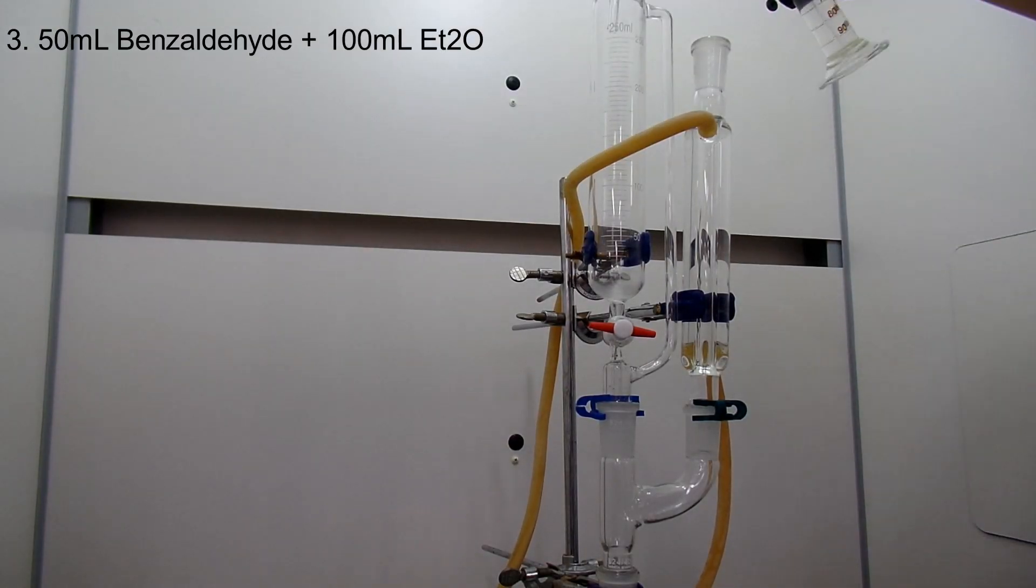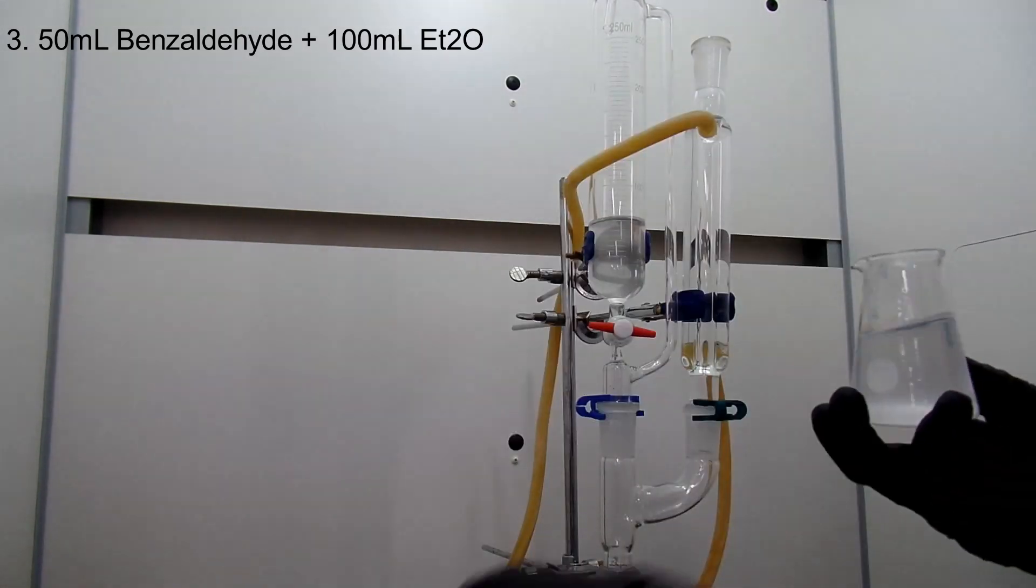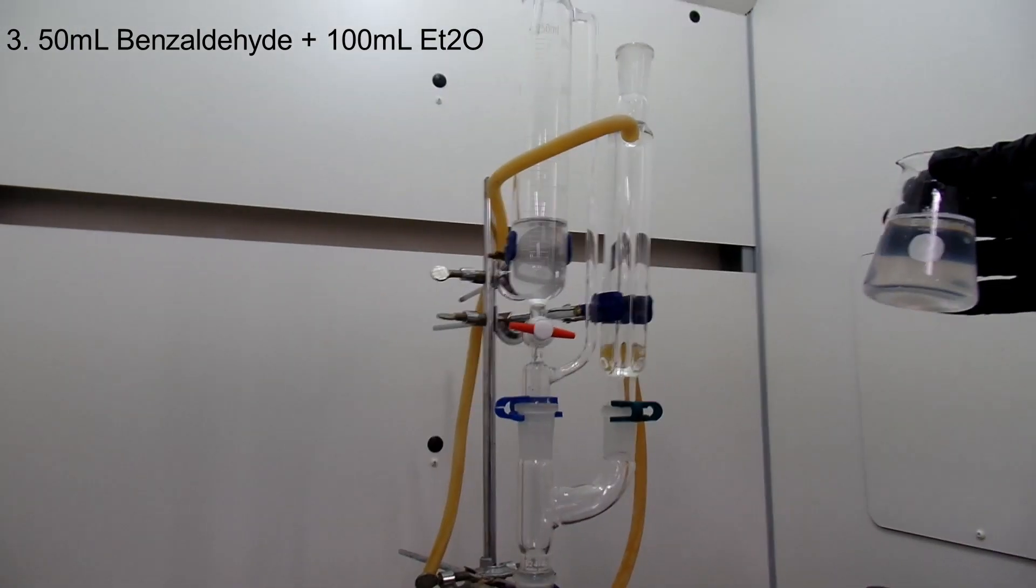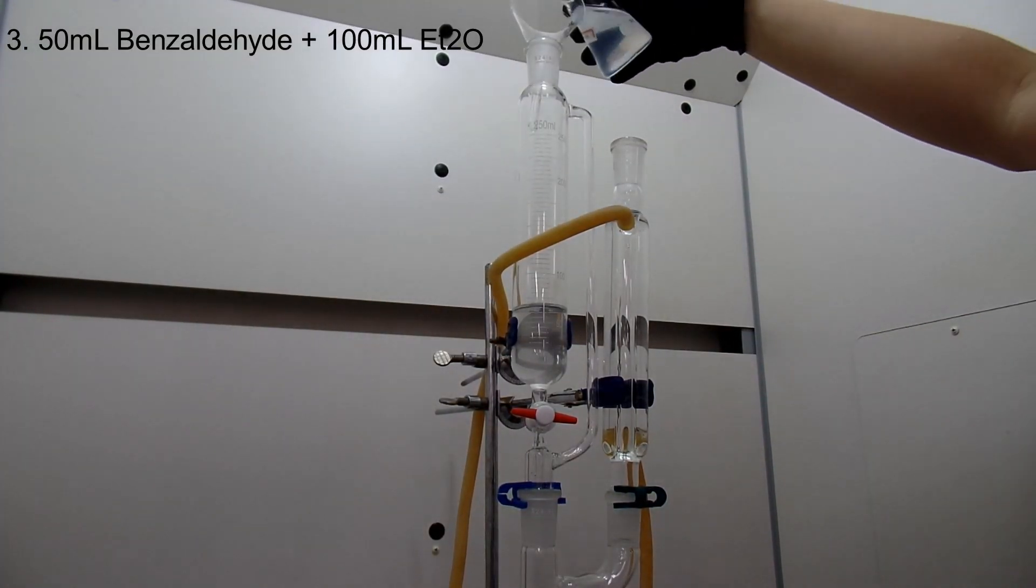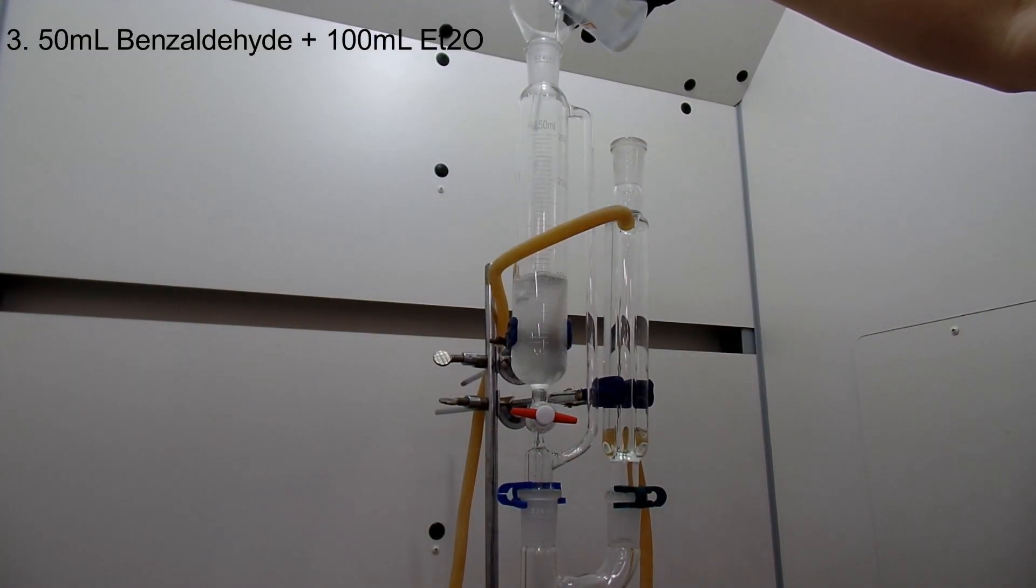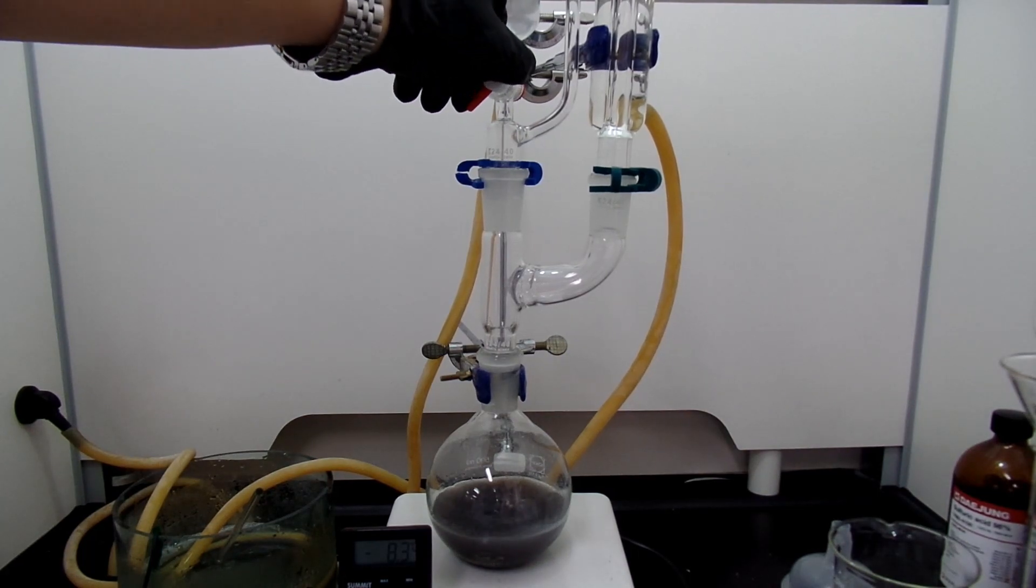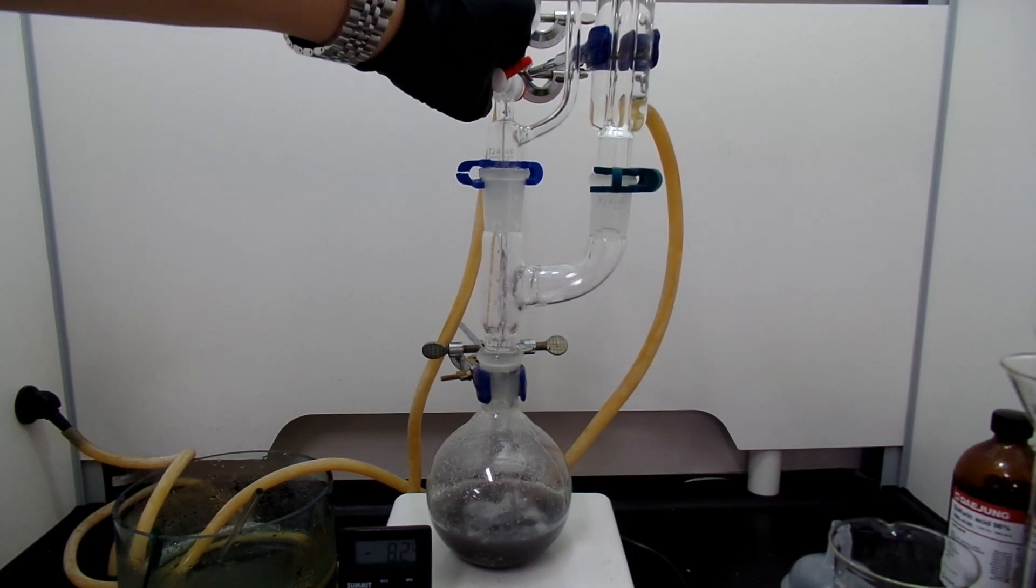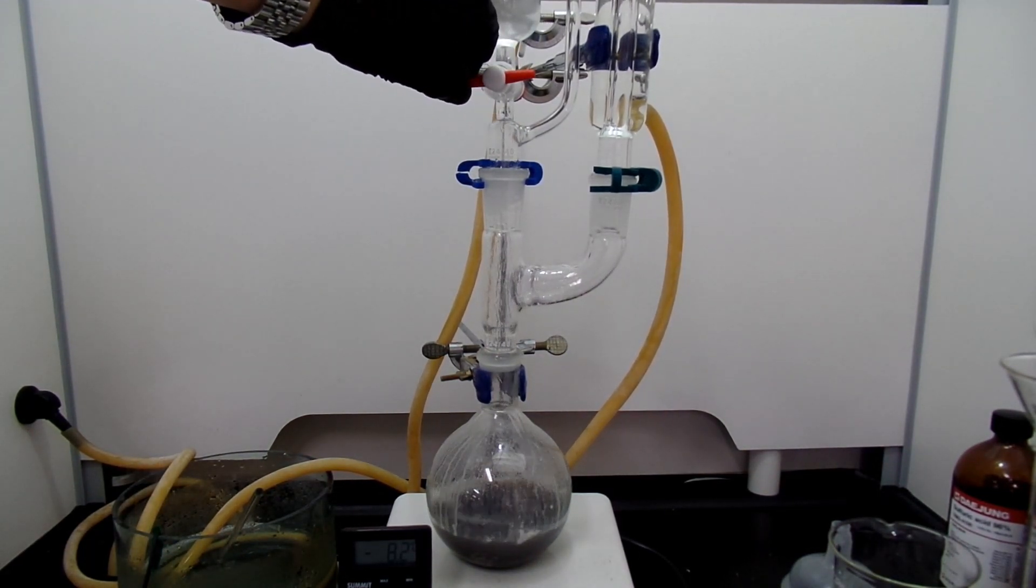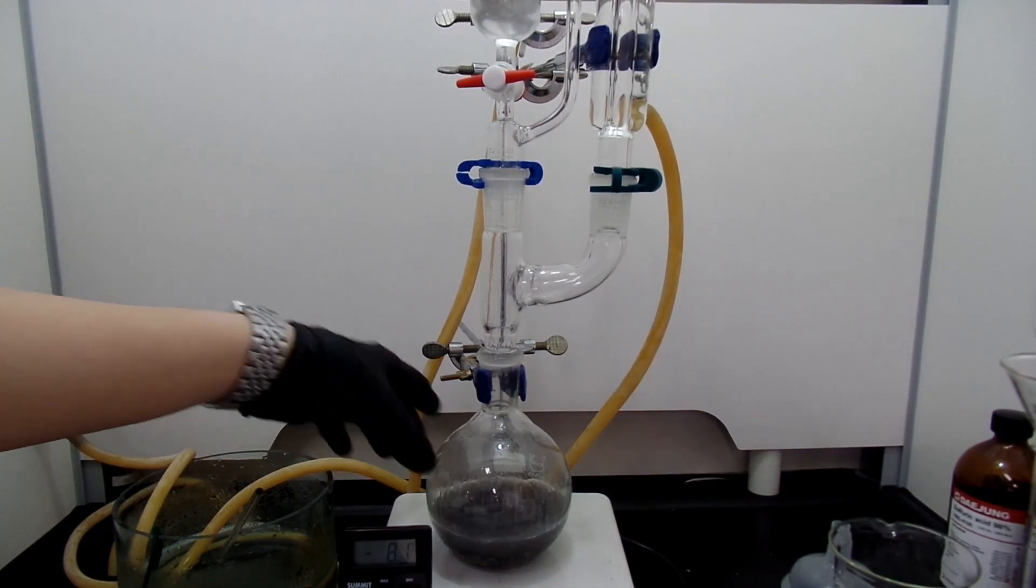When everything is added, I pour 50ml of benzaldehyde and 100ml of diethyl ether into the addition funnel. Add benzaldehyde and diethyl ether mixture dropwise. Here, with only small amounts, the reaction is pretty vigorous. After all the addition, mix it for additional 15 minutes.